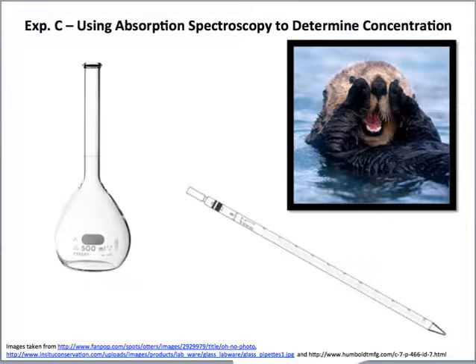All right, welcome back to the lab lecture video series. This week you're going to be performing experiment C, which is using absorption spectroscopy to determine concentration.